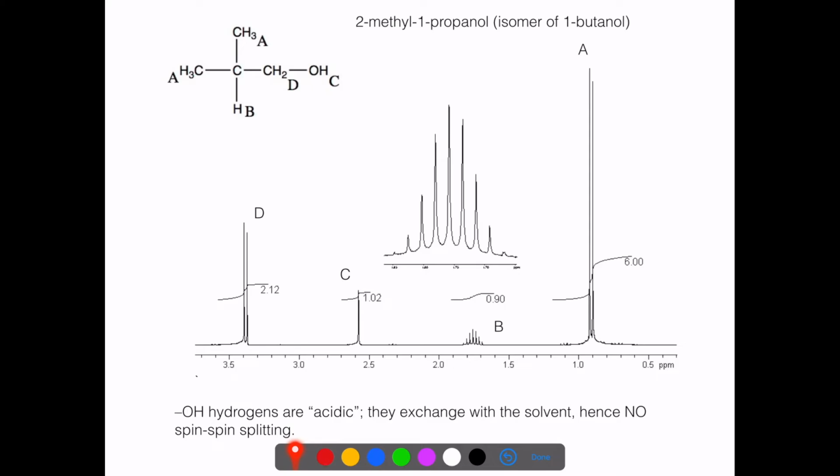So let's just approach this spectrum, again starting from here and moving downfield, A, B, C, D. Just note that in this particular spectrum, we do not have a peak at 0. Remember, we often see that, and that's known as TMS, and it helps to set the spectrum at 0. That is not shown here, but it often is. So, peak A deals with these hydrogens right here, and there are 6 of them. We see that the integration here is set at 6. We also get the signal at about 0.8, which is fairly typical for methyl groups, about 0.8 to 1.